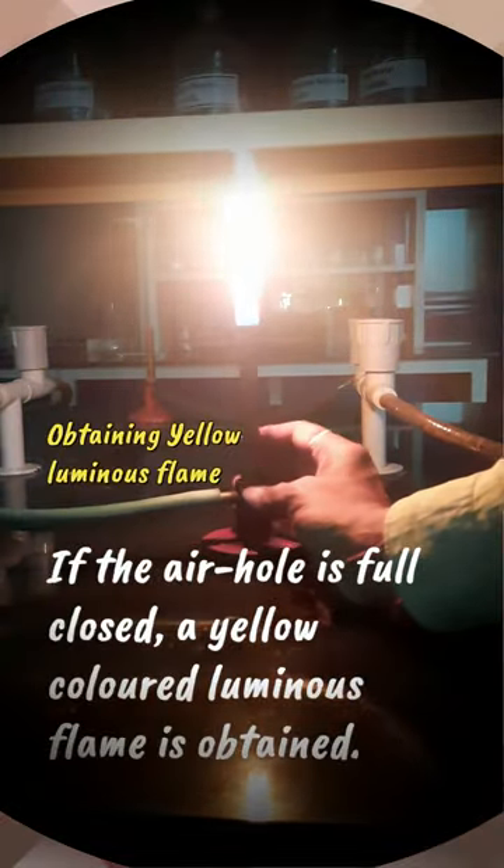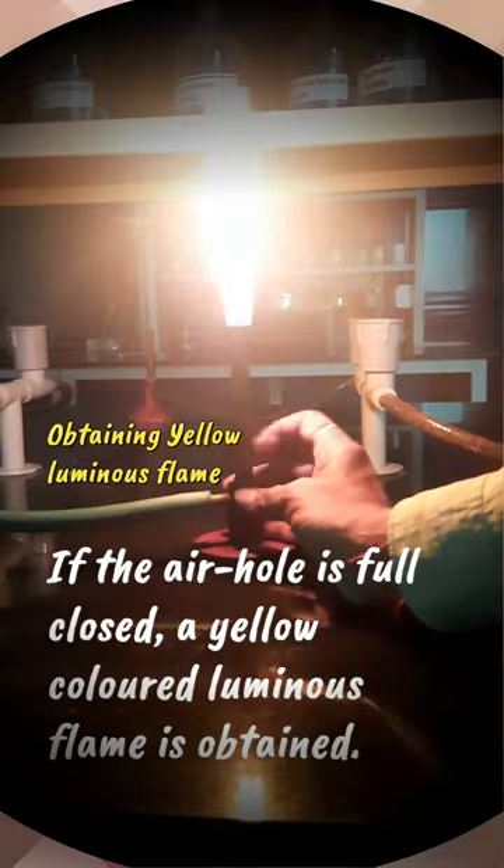If the air hole is fully closed, a yellow colored luminous flame is obtained.